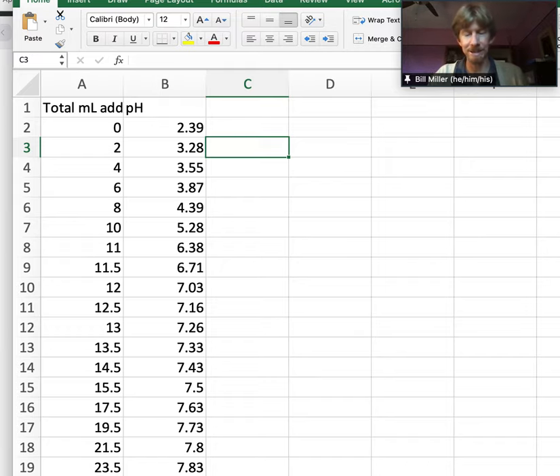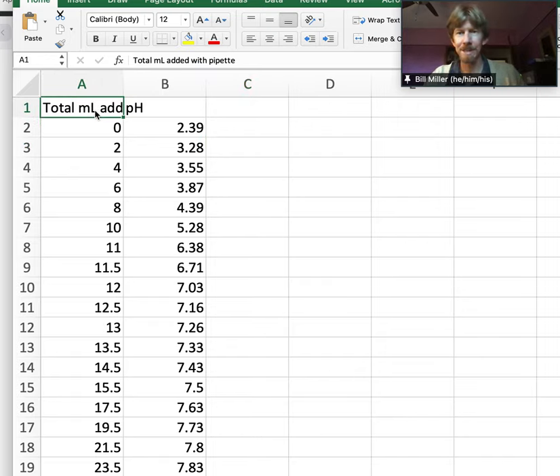Before I do my next two trials, I want to graph each set of data in Excel. I've got total milliliters added here in this column on the left, and pH on the right.